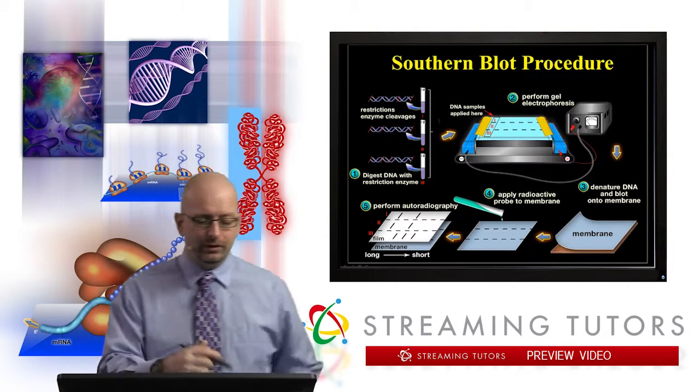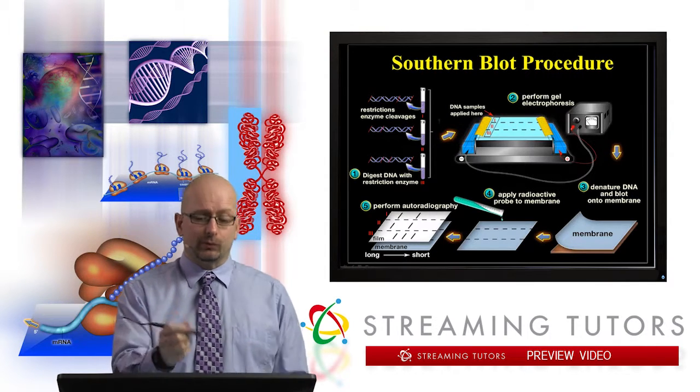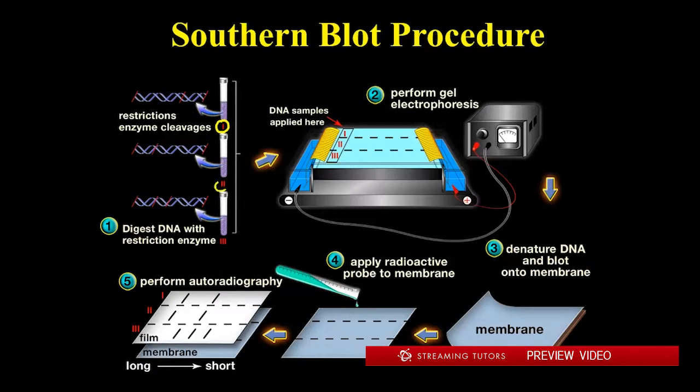So the procedure is here. I'm putting a scenario in this picture where, let's just say it was a paternity test, and there are 3 individuals, number 1, 2, and 3. All of them are possible candidates for being the father. What I've shown is, in a particular DNA region of interest, and often it's not a gene, different cuts with the same restriction enzyme. So 3 different people, 3 different patterns, and after you have the cleavage, in these tubes are going to be floating around fragments of whatever size.